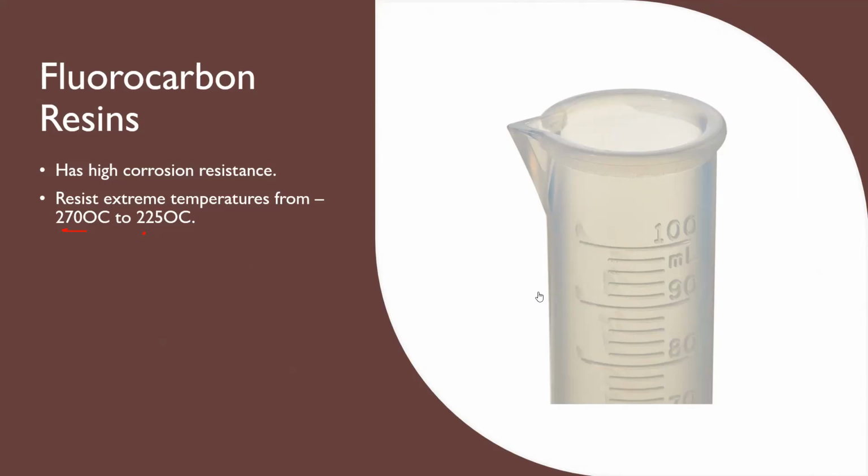Okay? So ibig sabihin, it is not necessarily because it is a plasticware that it can't be resistant to heat. The other way around, it doesn't mean that because this is a glassware, it can resist high temperatures. There are glasswares that can resist high temperatures, and there are plasticwares that can also resist high temperatures.